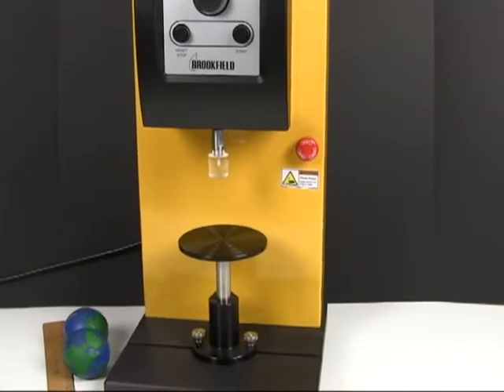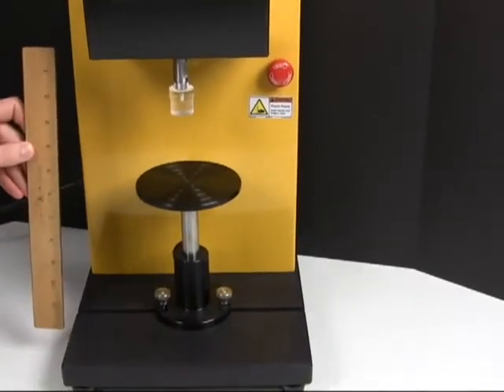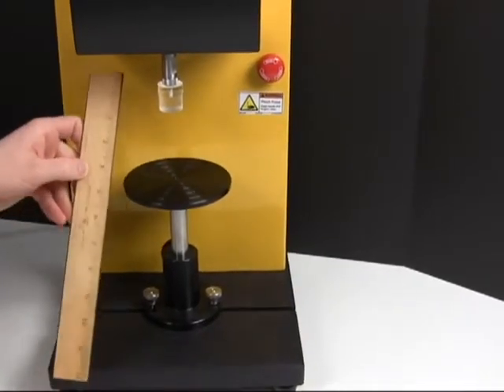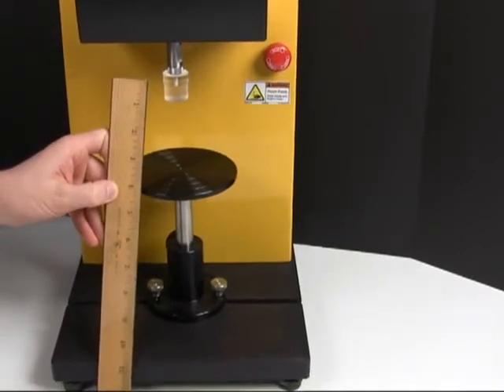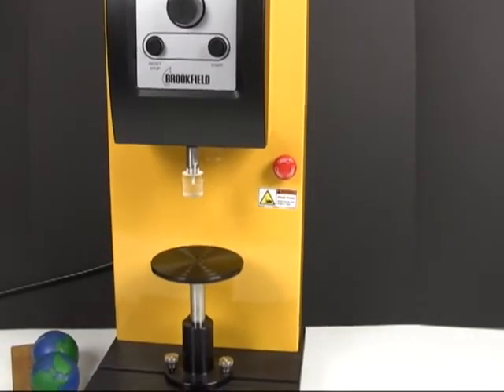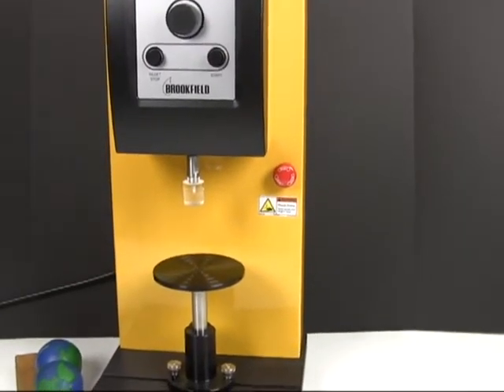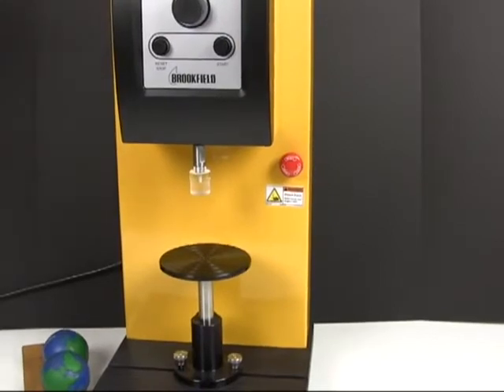The probes have a 4-inch travel range, meaning that it's pretty limited in terms of the fixtures you can use and the types of tests that you should be able to do. Completely forget about conducting backward and forward extrusion tests — you just don't have the vertical travel range. This is generally a problem for testing any type of products, especially food that come in their containers, because whatever space is in the top of that container is wasted in travel range.